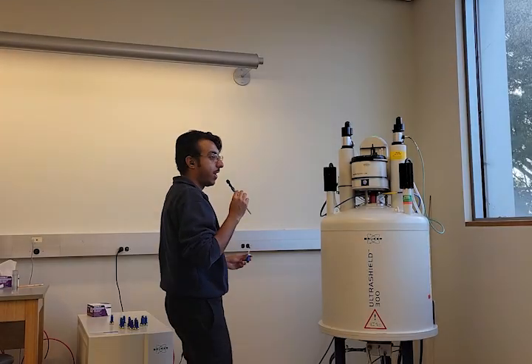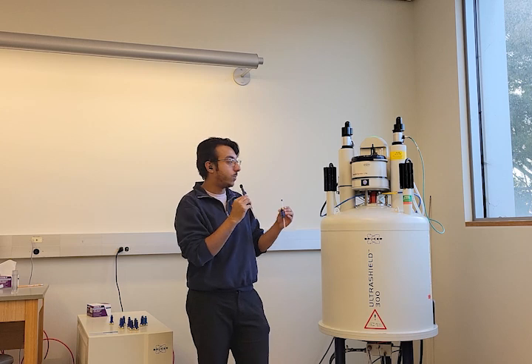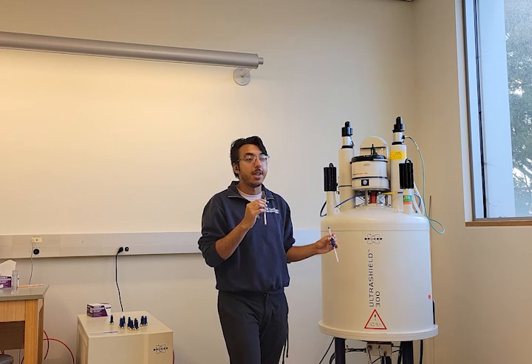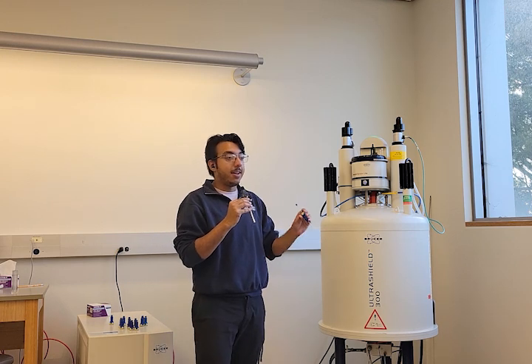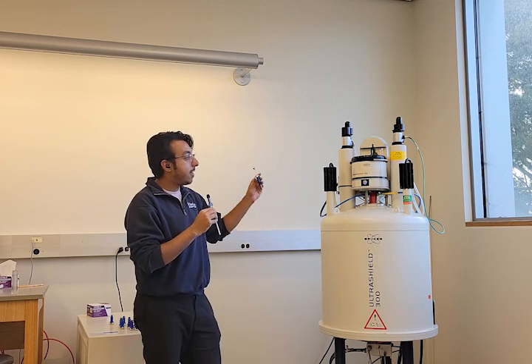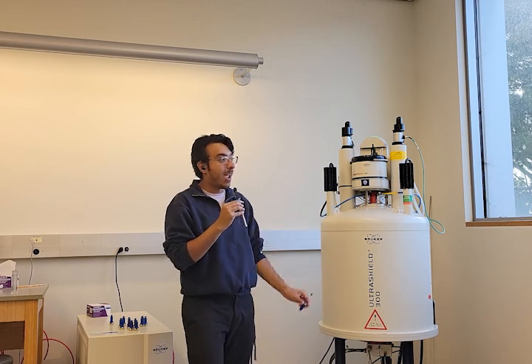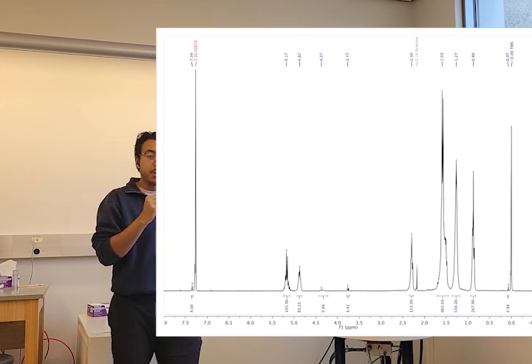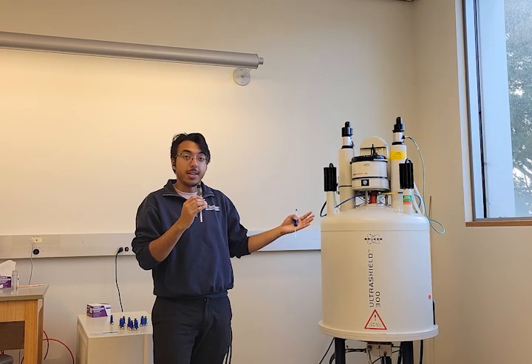There are some rooms that don't allow you to bring in your PPE from the lab. This room being one of them, where it holds the NMR, our next instrument that we're using. It stands for nuclear magnetic resonance, and all it is in a nutshell is a really strong magnet that analyzes the relationship between, in our case, the hydrogen atoms of our sample and its relationship to the magnetic field that was created by, well, the magnet. And our data looks like this, and every peak represents a group of hydrogen atoms. And with this, we're able to find out what our molecular structure looks like.